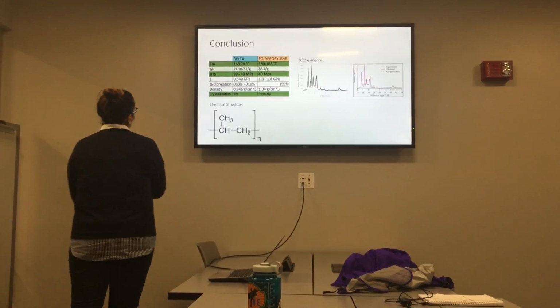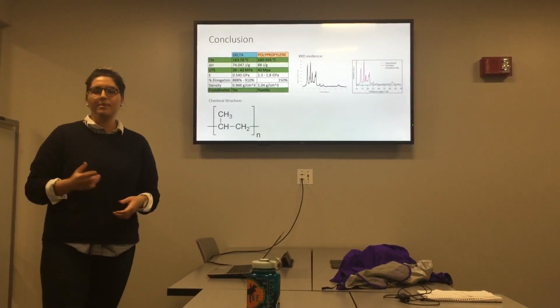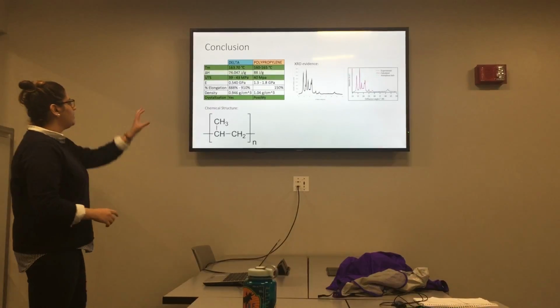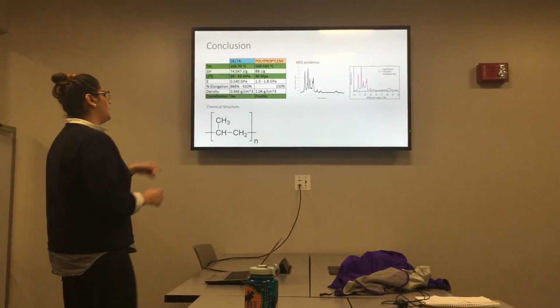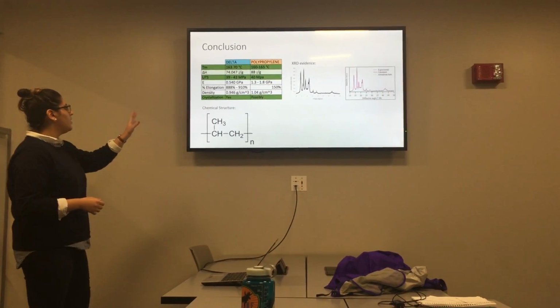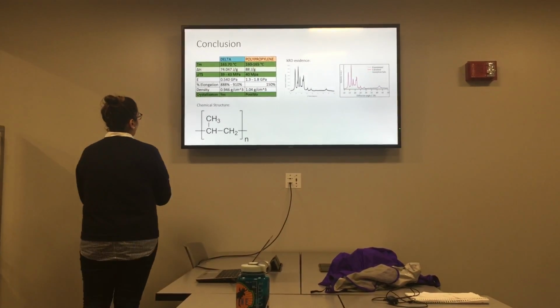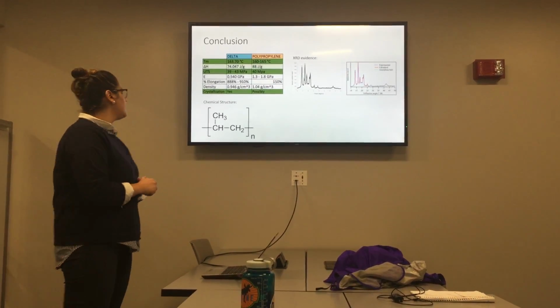So in conclusion, we decided that the delta was polypropylene. We really wanted to get something more specific than polypropylene, but we really didn't have enough evidence to pin down exactly what it was. So the results that we talked about throughout the whole presentation are kind of summarized here on the slide. You'll see that the melting temperature was very spot on. We got a value of about 164, and all the literature values we found were 160 to 165, so we're really happy about that. The ultimate tensile, again, was really spot on.